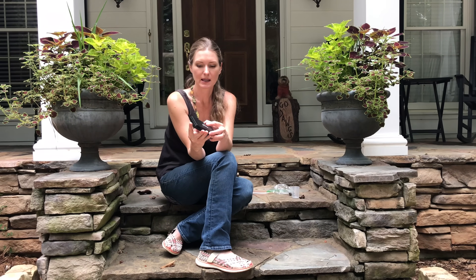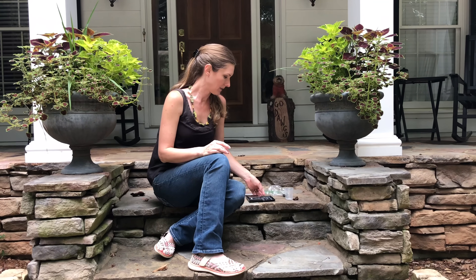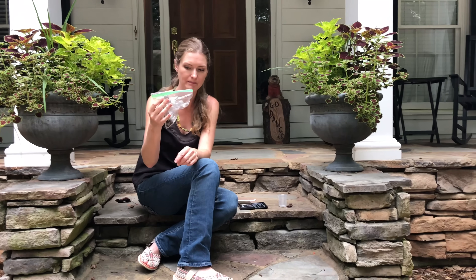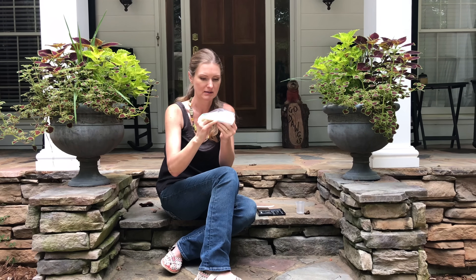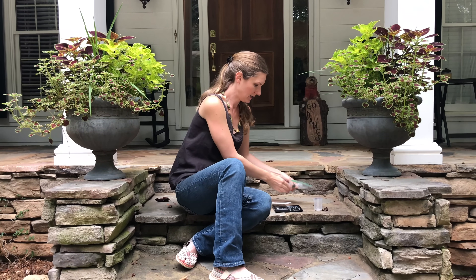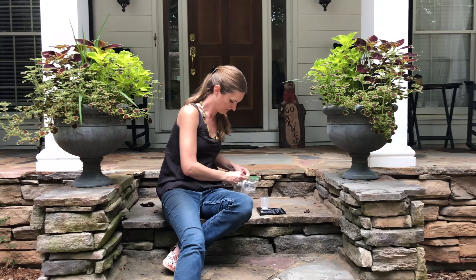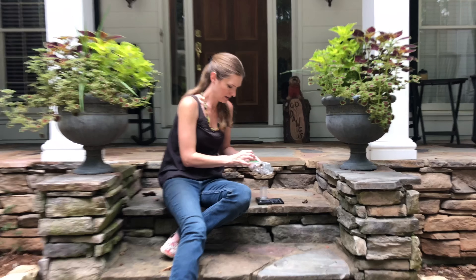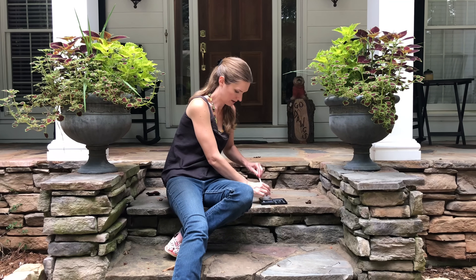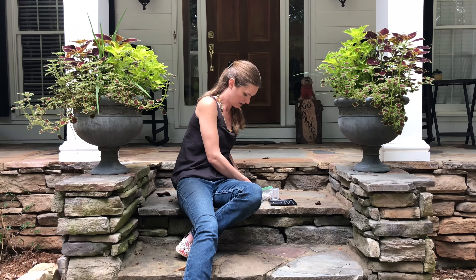One thing I forgot to mention is a gram scale — I also got this one on Amazon for about $11. You need to be able to measure two grams of poop. I use Ziploc baggies, turn them upside down and grab the sample, and mark them with a Sharpie. We're doing Catlin today. I've got a couple of berries in here — I'll just mush those together and measure out two grams on the scale.